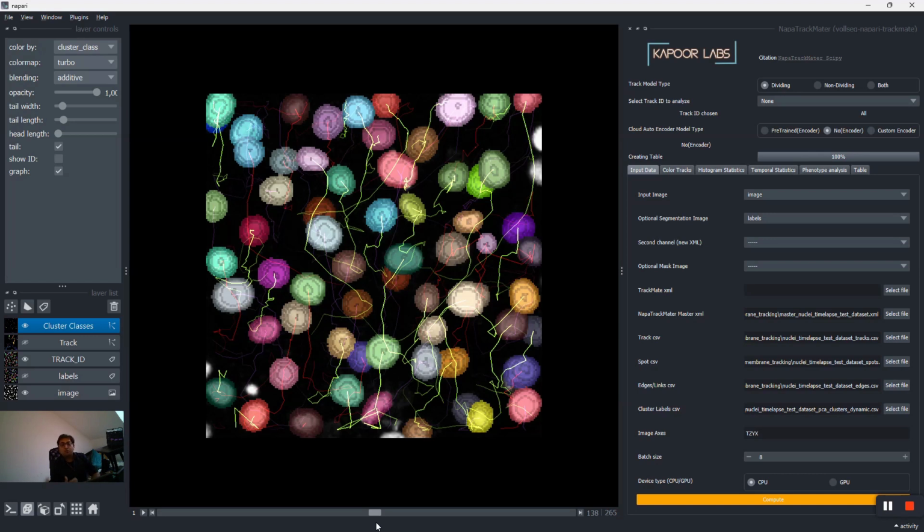And now you are close to answering the biological question of your interest on how these cells decide their fate, for example, or any other kind of question that you may have: do the cells start in the center of the tissue and then move to the border, or how is the dynamics happening in my particular experiment. And that's where I leave you to it, to use the plugin, do the tracking, and if you want our inputs, we are always happy to help you in creating these tracking data that actually helps you then get the science out of your experiment.